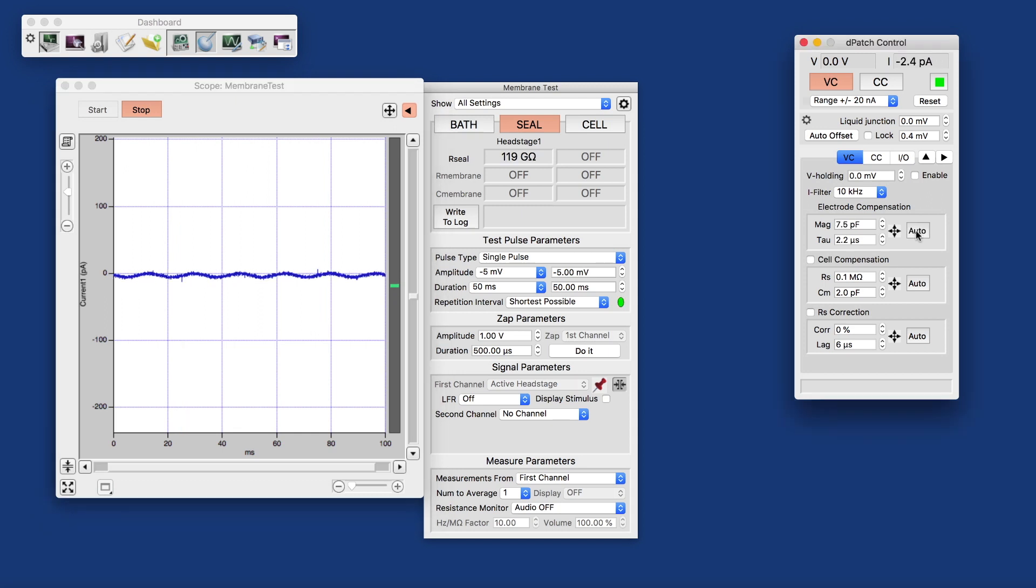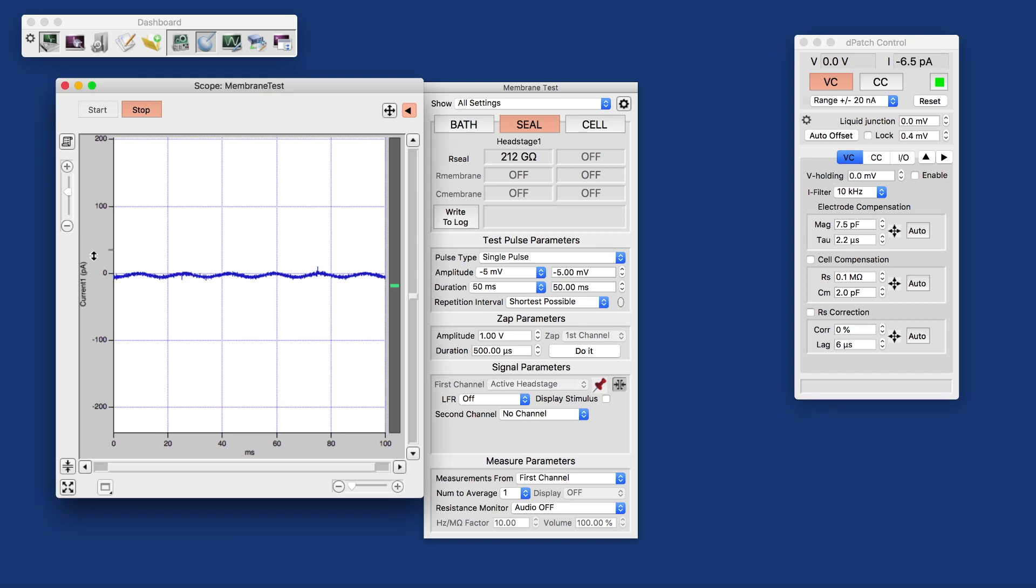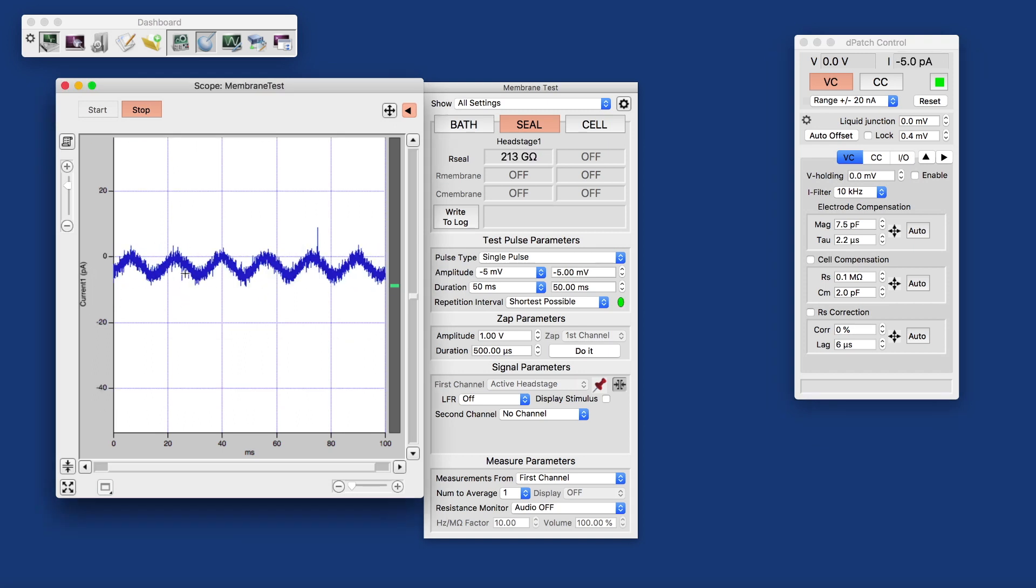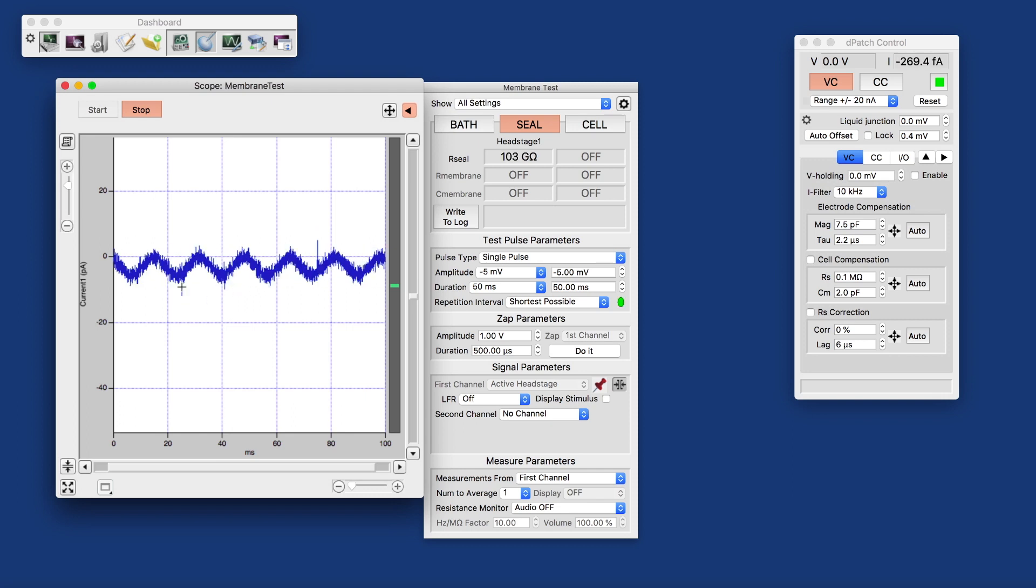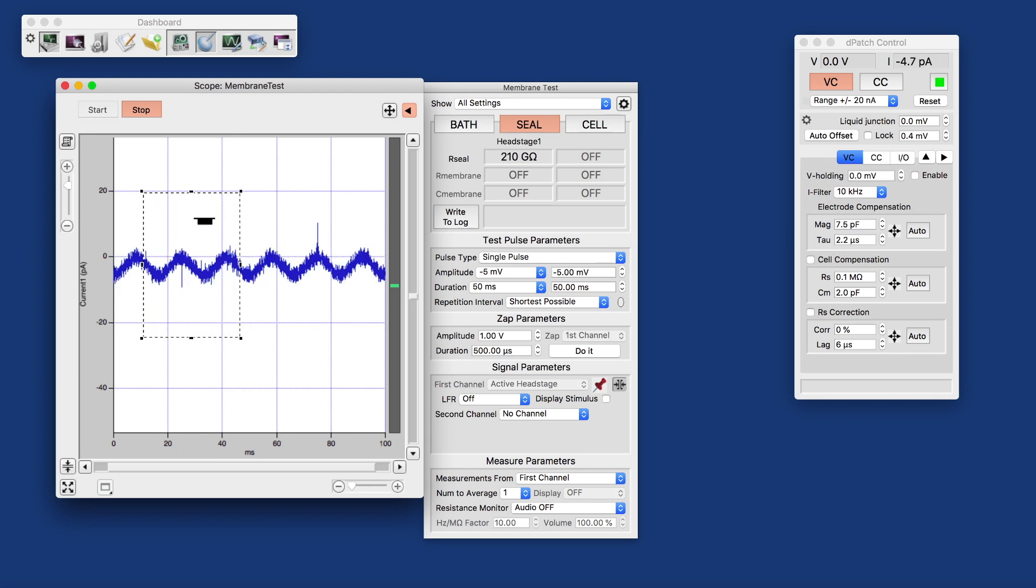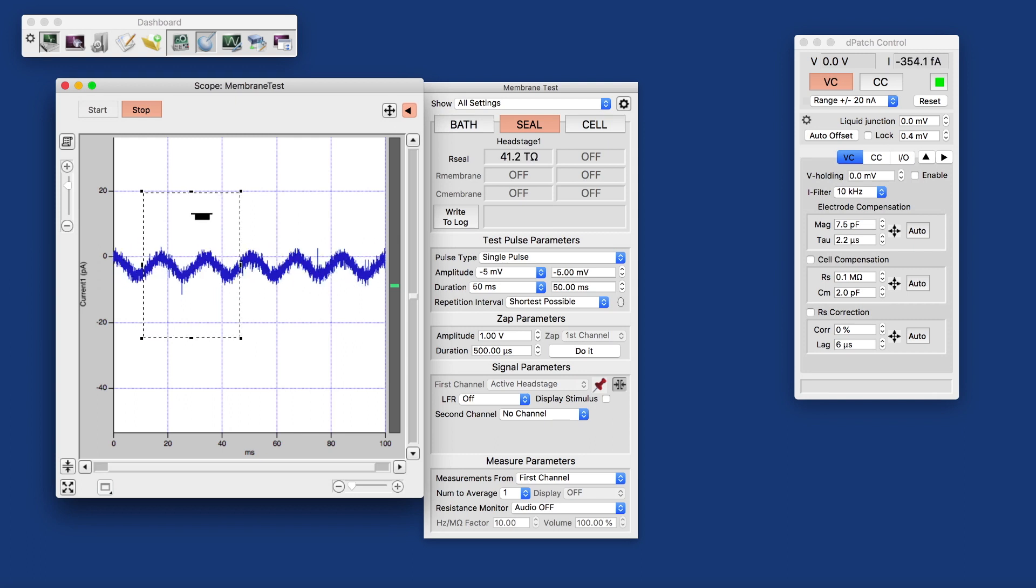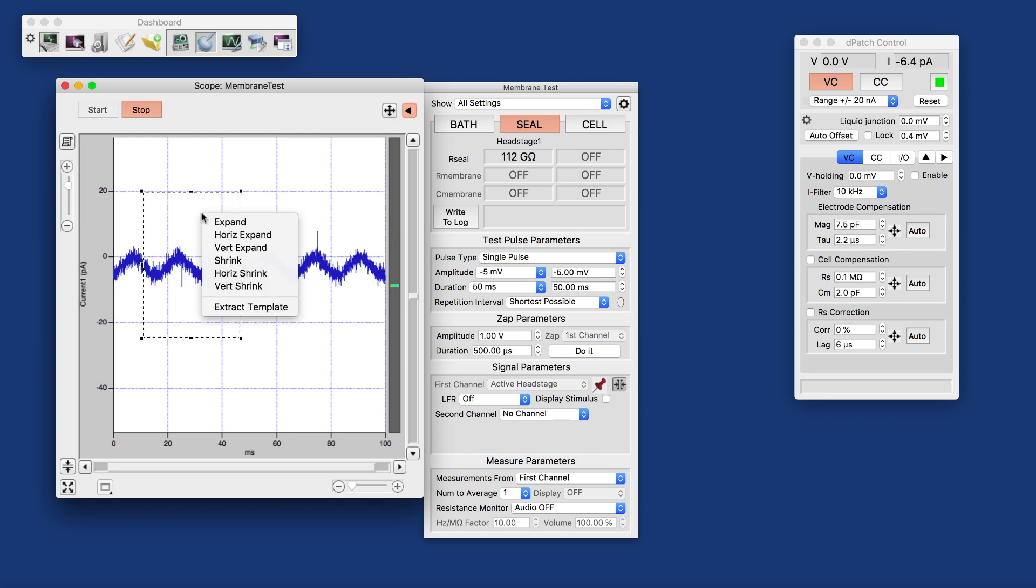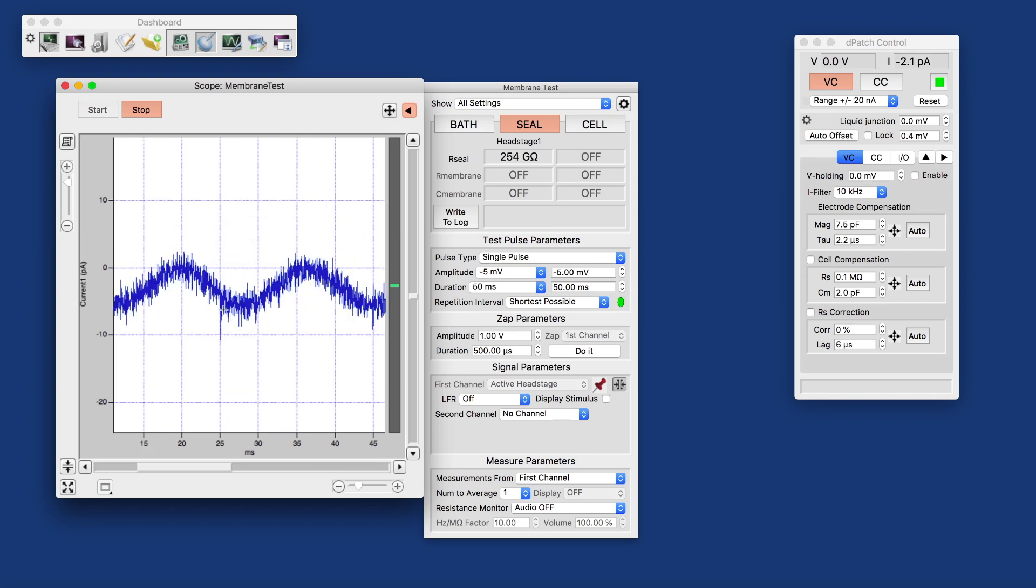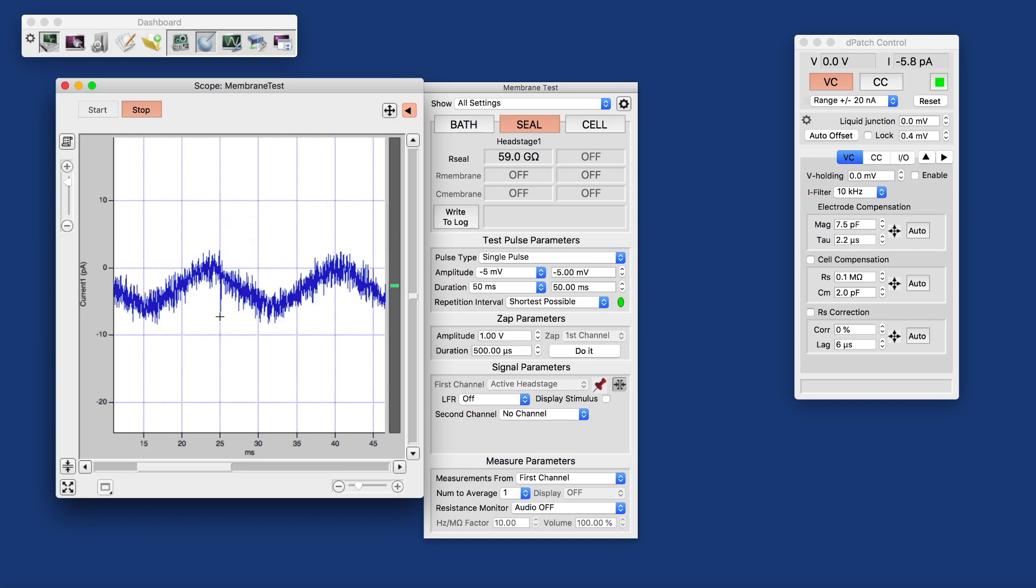And what we would normally do is click auto for the electrode compensation, so we would compensate for the electrode capacitance. And the auto algorithm in many cases almost completely eliminates the pipette capacitance, the transients. And what we can do to zoom in is here expand by dragging a marquee and then expanding here.